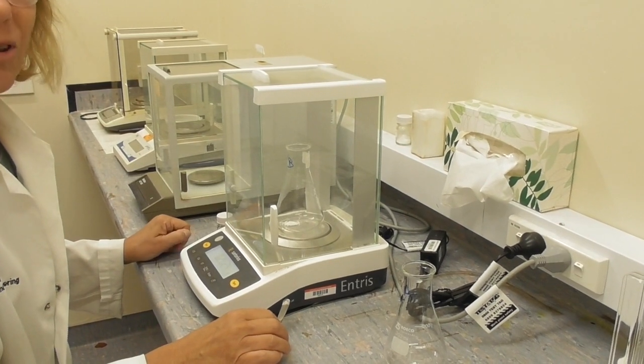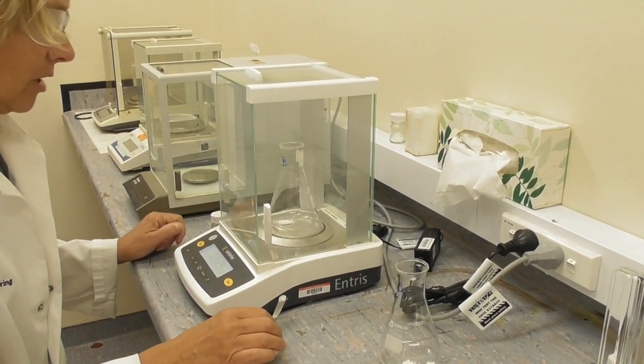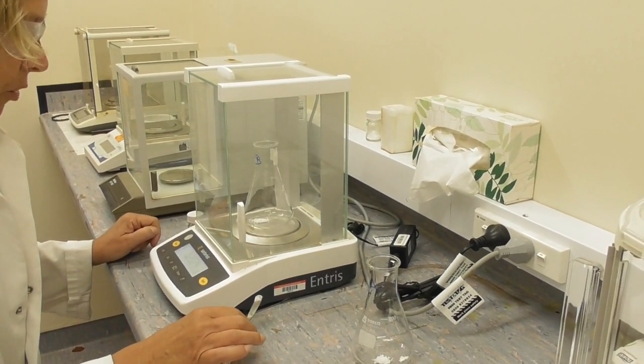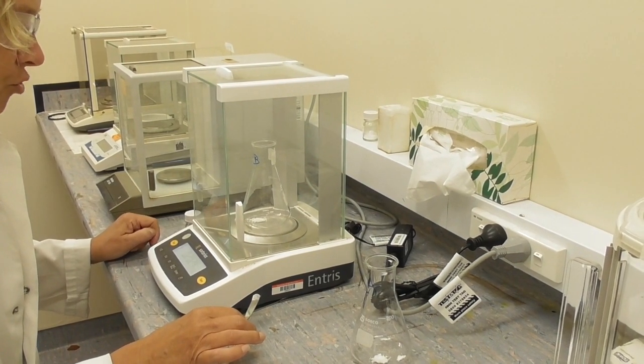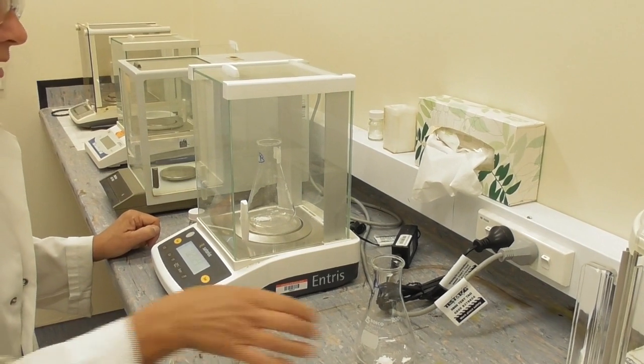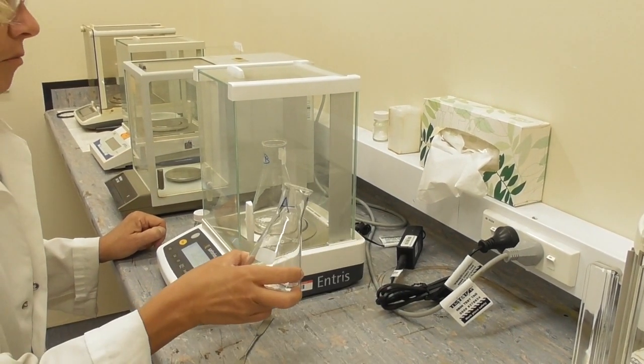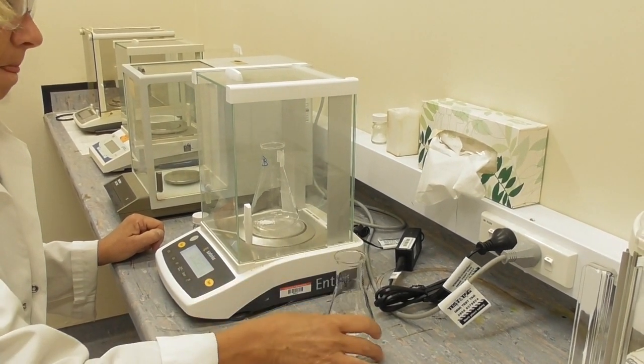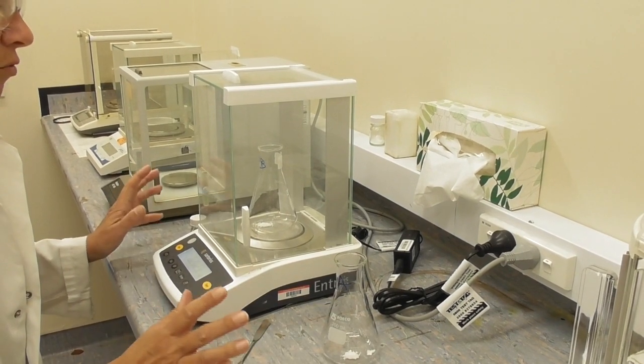As this titration needs to be done in duplicate, I prepare the second flask at the same time. The flasks are now labeled with A and B so I can tell them apart during the titration. The weight in the second flask is 0.2024.